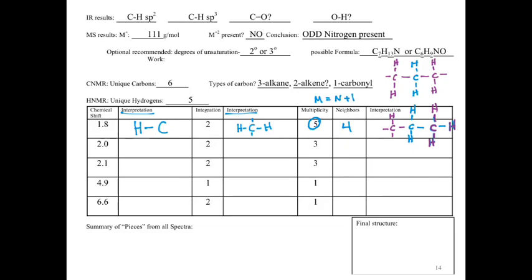Kind of up to you how you want to interpret this. I personally take a look at each of these and say, okay, what's the big difference? The big difference is that in one case I have a CH3. So if that interpretation is valid, then I should have a signal that integrates to 3 hydrogens, because if my spectra is correct, it should be there.